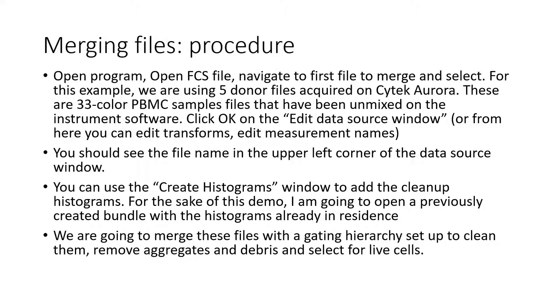For this example, we're using a set of five donor files acquired on a Cytek Aurora — these are 33-color PBMC sample files that have been unmixed on the instrument software already. When you open the file, click OK on the Edit Data Source window. This is where you can edit transforms, measurement names, and so on. You should see the file name in the upper left corner of the data source window.